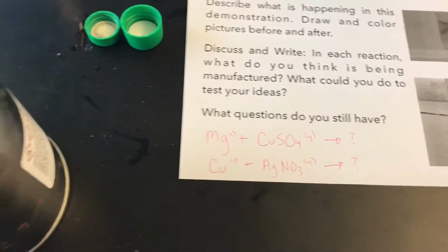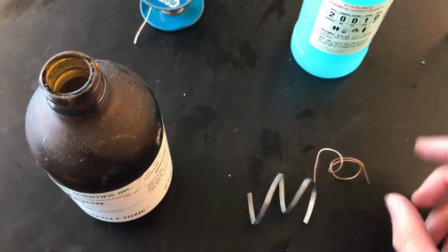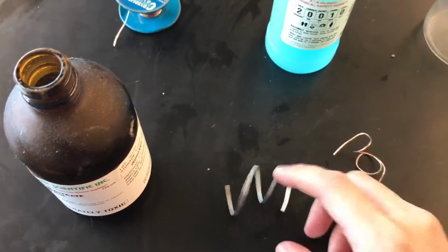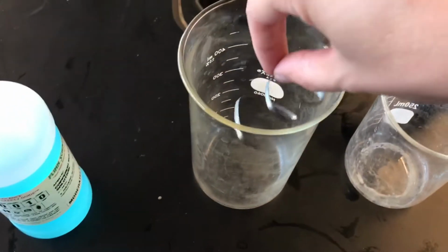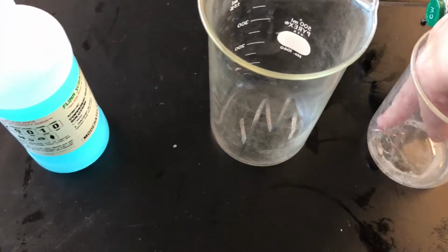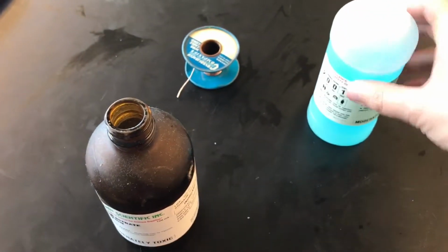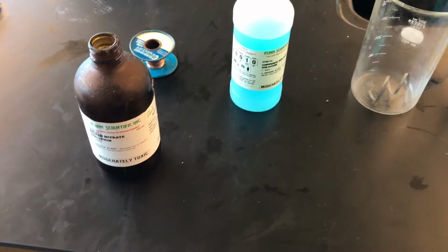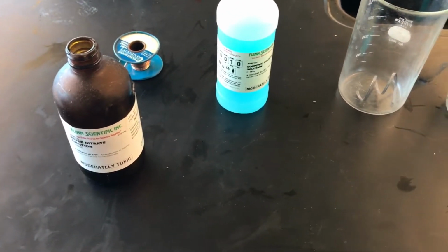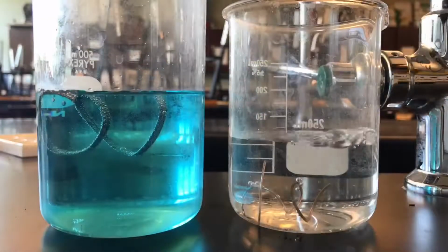Okay? So the beforehand kind of pictures. This is my magnesium ribbon, and this is my copper wire. And so I'm just going to kind of put those inside of these beakers. Like that. Okay, hopefully it's clear enough that you can actually see what's happening. I'll just kind of move that over a little bit. This is my solution of copper 2 sulfate, and this is my solution of silver nitrate. Okay? And so I'm going to pour that in and set up my camera, and then just watch the reaction.